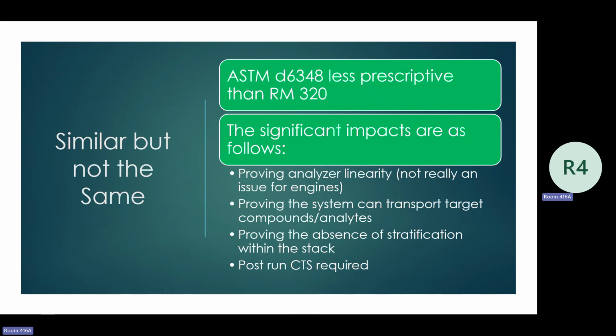What they are saying is when you have very low concentrations for a compound of interest, you'll have to make sure that you've got reference spectra that will bracket your anticipated concentrations. That's not going to be a real issue, I don't think, on the engine testing. We have volumes of reference spectra available for CO, for NOx, for propane, which is typically used to calibrate for your volatile organics. We'll have to see how they treat VOCs with that.